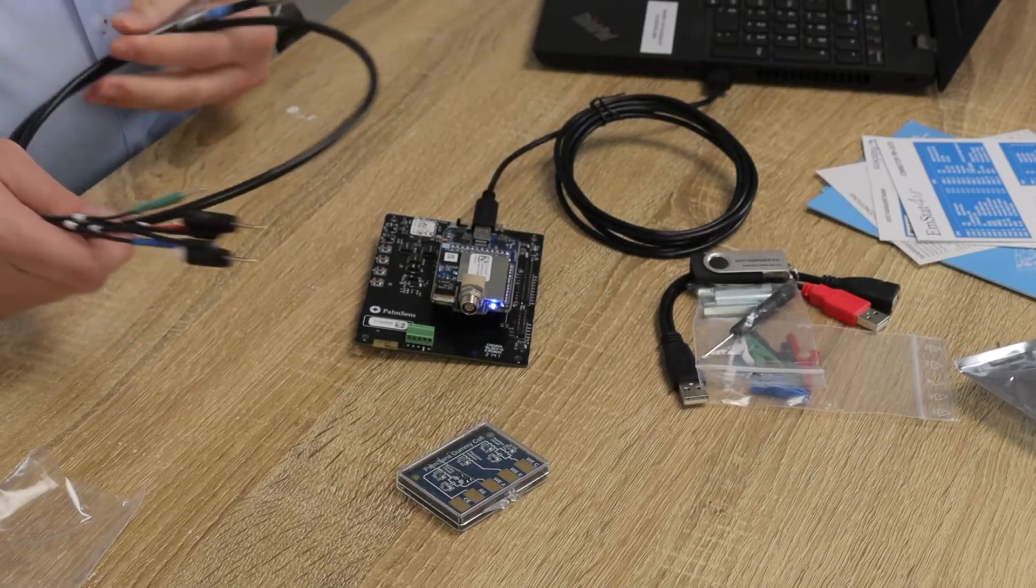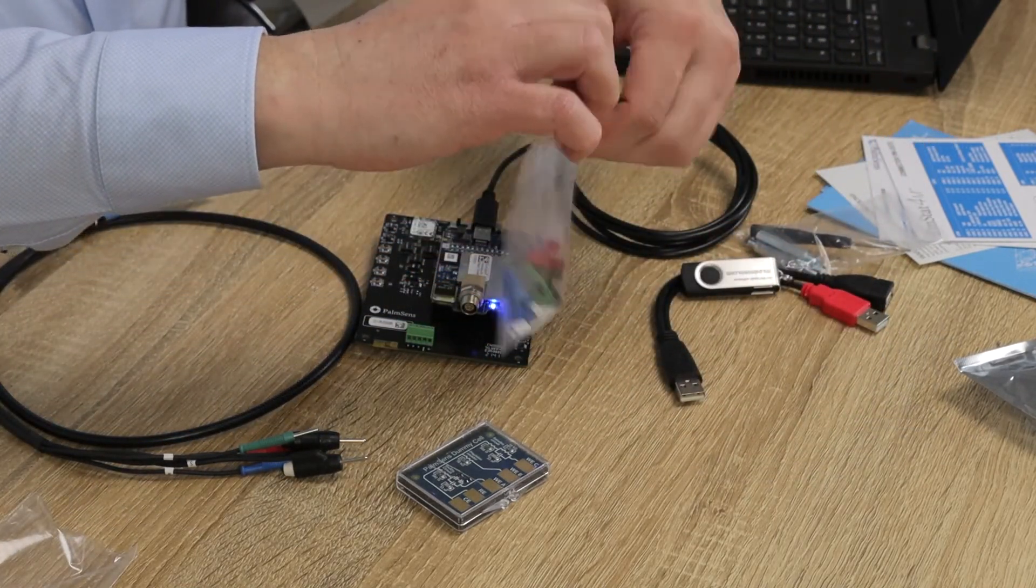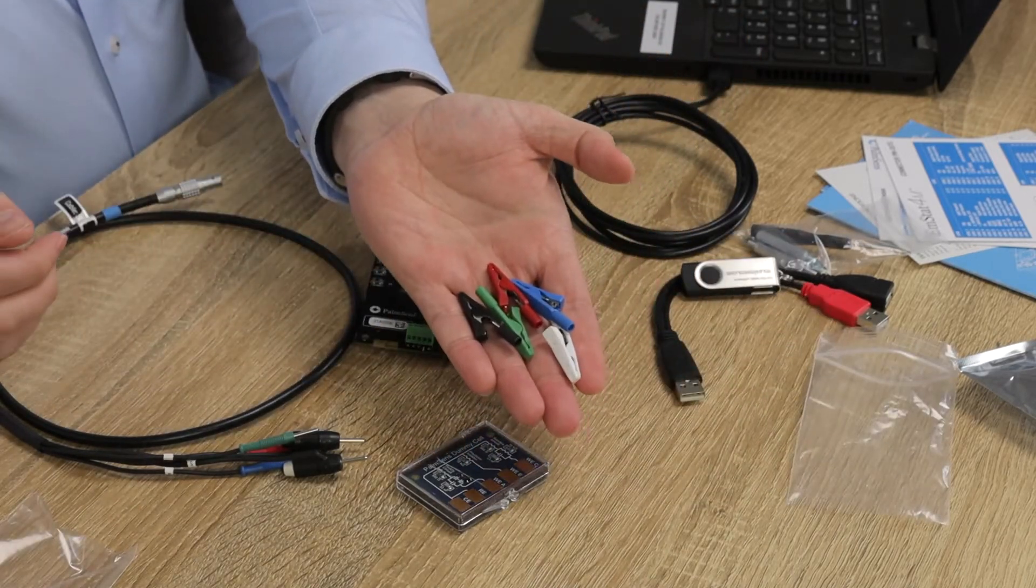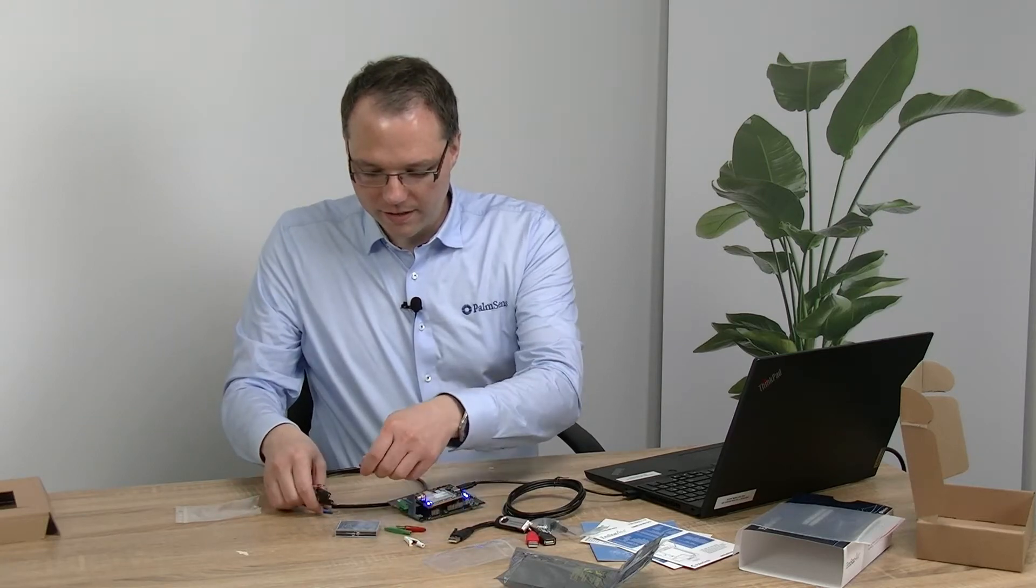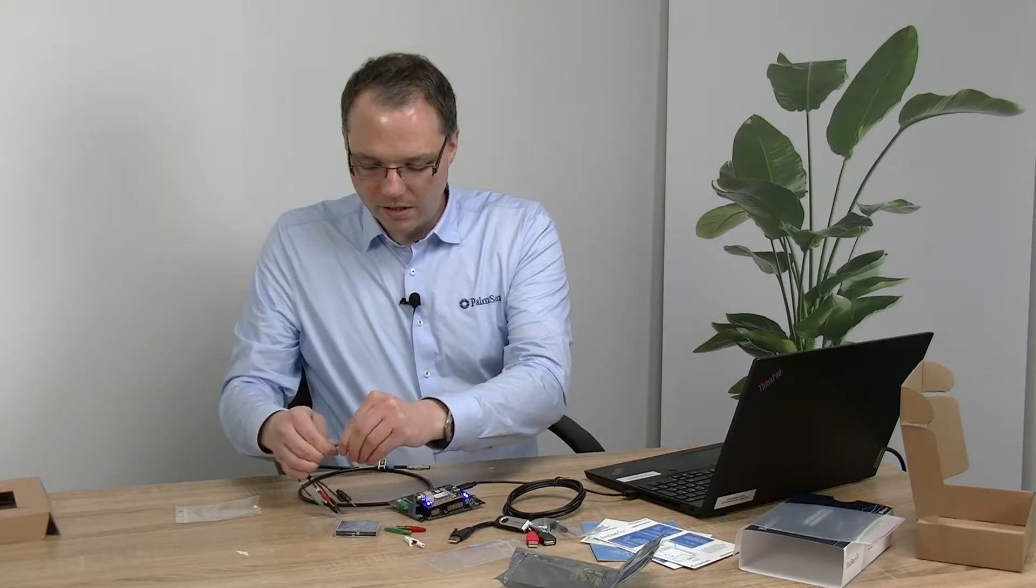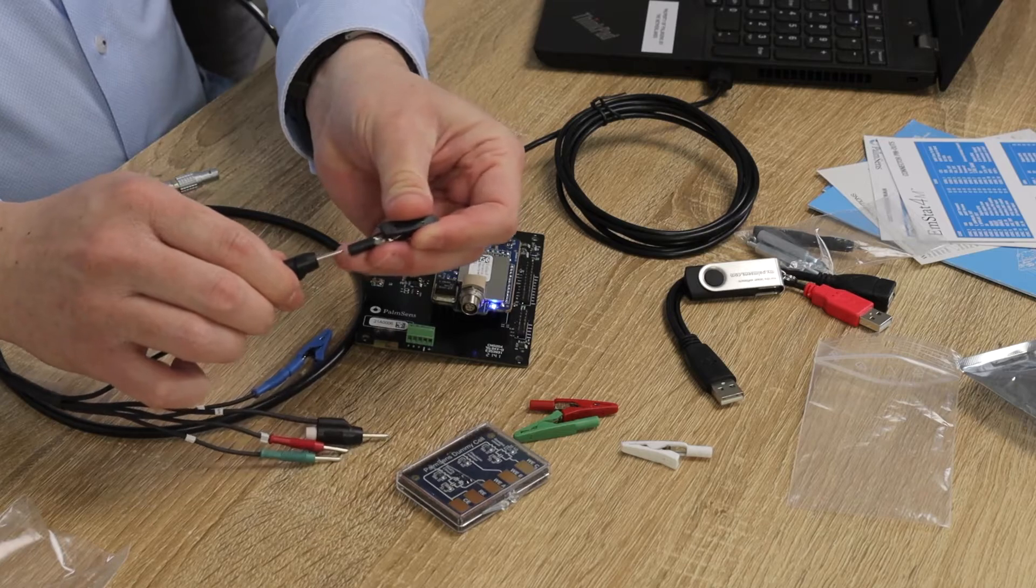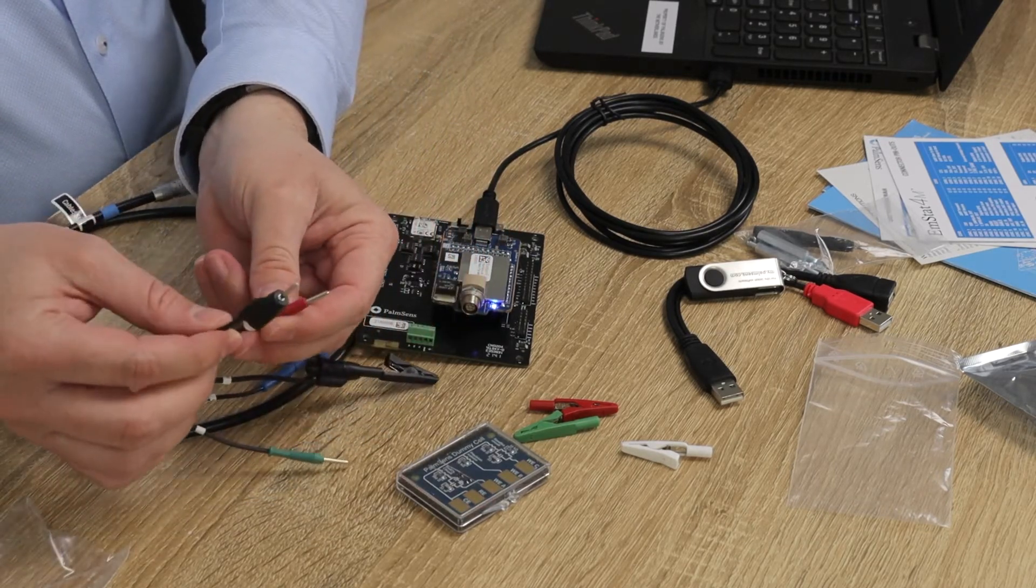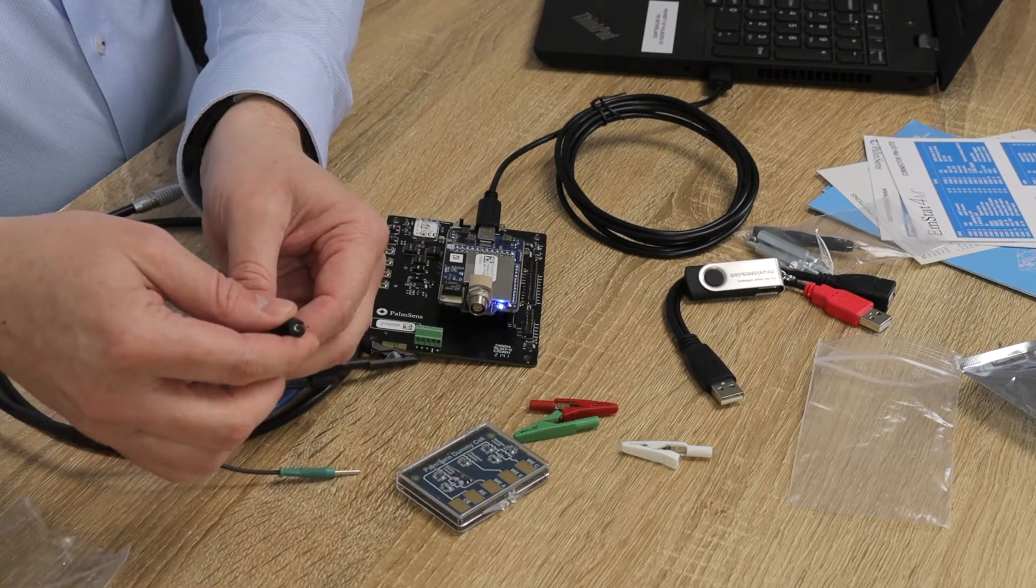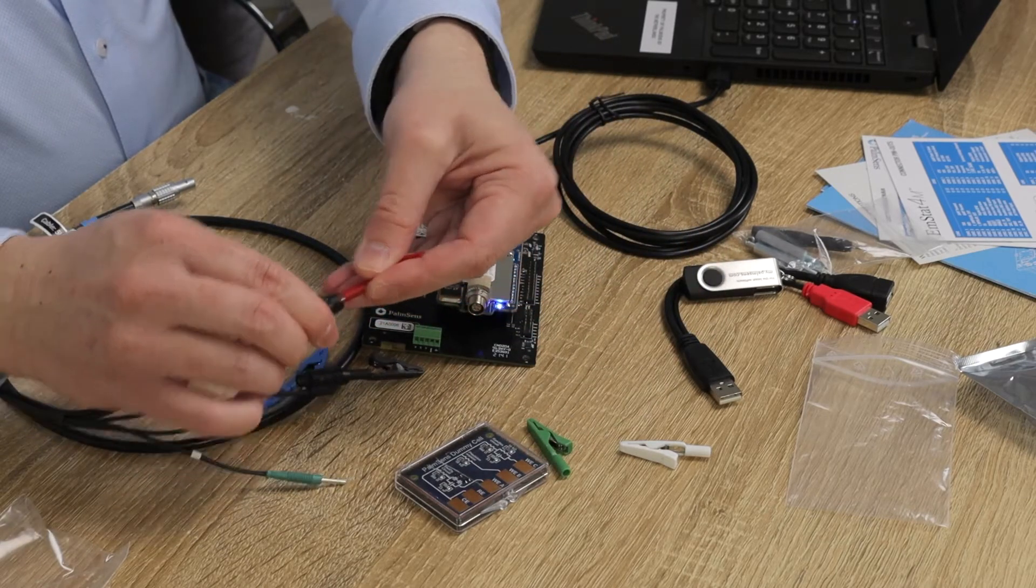Right, then I will first prepare the cable. So I take these clips and what I will do is I connect the blue clip to the reference electrode, the black clip to the counter electrode, and because my sense lead will measure at the same point where my working electrode does, I just stack them and then I put the red clip for the working electrode.